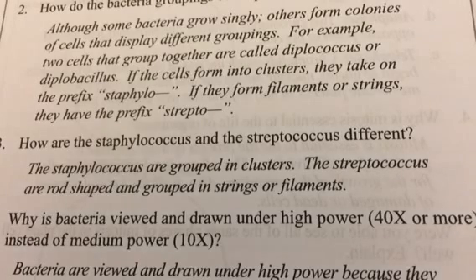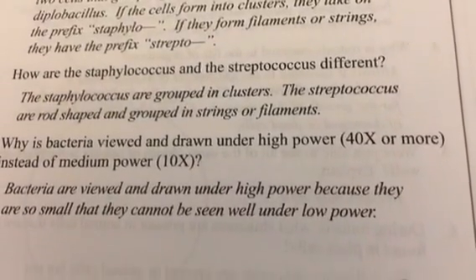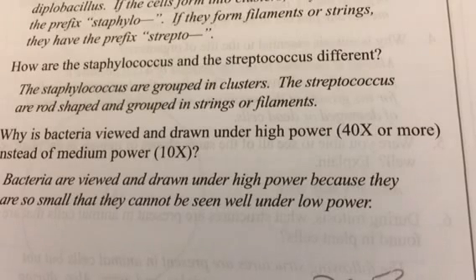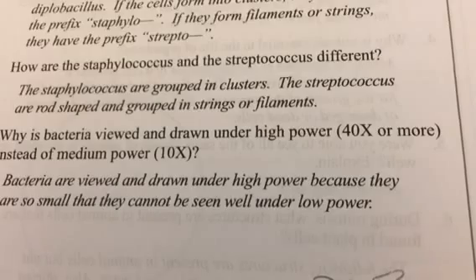Number 4, why is bacteria viewed and drawn under high power instead of medium power? Well, we know that because they're so darn small. Right? They were not seen very well under low power. We had trouble finding them. So that was page 53.